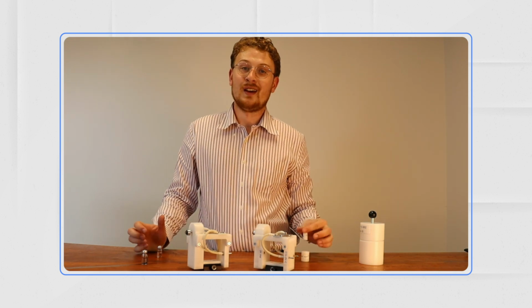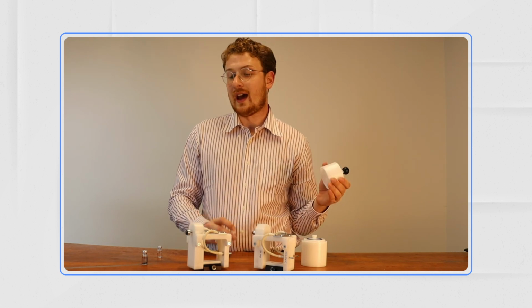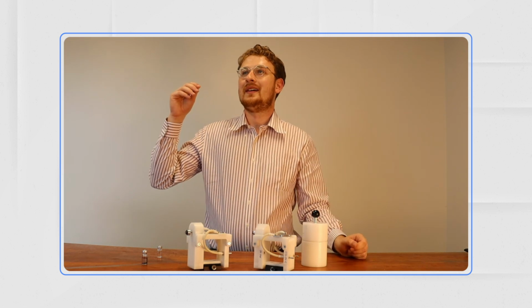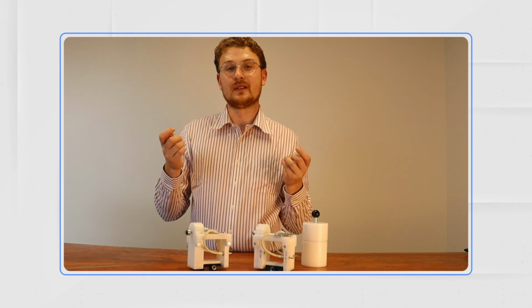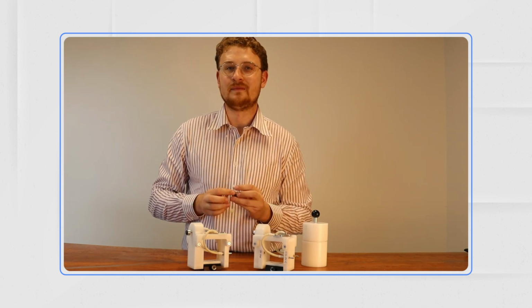Or the other option, a little bit unconventional, but definitely available to them, is they can go back to the vacuum solution and actually test the vials empty and do a statistical sampling test method with the empty vials to prove that the container closure system itself is suitable and is working, even if we can't test it with the product inside. And that is completely acceptable, completely valid by all regulatory standards. So we're in a little bit of limbo right now, but we know that there's solutions available and the customer is happy and is still working with us, so everybody came out ahead.